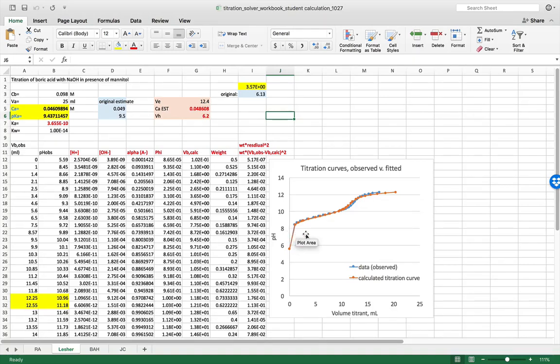So this is how titrations should act, and it's a more theory-based way of determining the equivalence point that doesn't rely on me having gotten that little drop of titrant in the flask at the exact right moment so that I hit the equivalence point right at the proper time. So for that reason, it's a little bit better than just estimating or interpolating between 2 points.